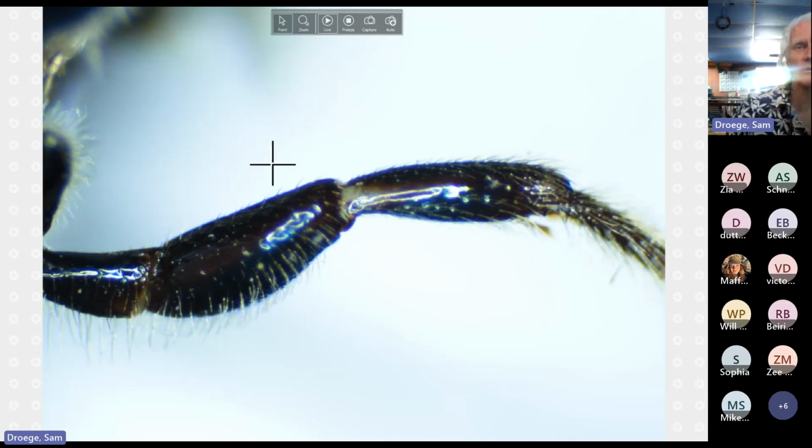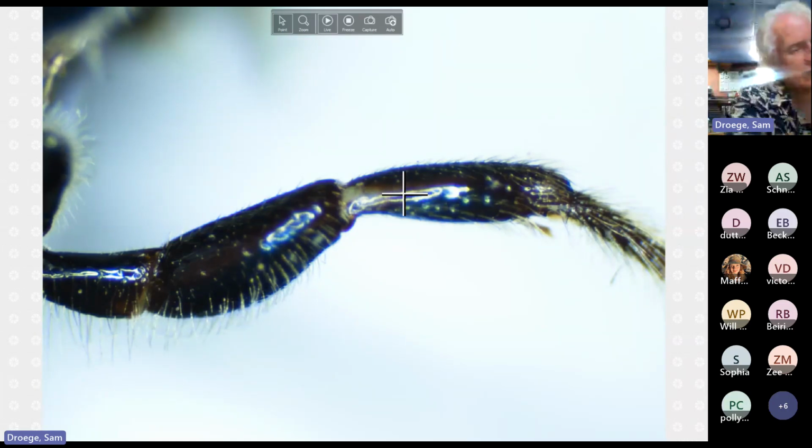This goes out of focus a little bit, but okay, here's the tibia. This is floridana, and here's the femur. There might be a little reflection here going on, but there's no yellow mark on the femur. And this yellow mark is partially disguised by the lighting in here. Oh, I forgot to turn on a couple of the lights. Maybe that'll help.